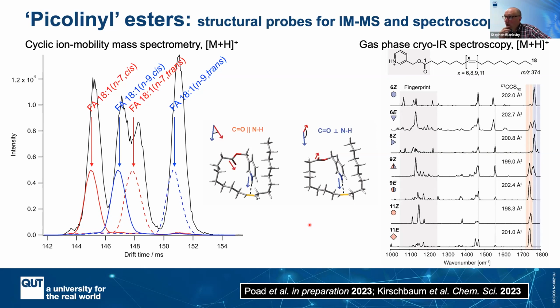And I think the other thing that's been really powerful that Avanti have done is to really look at the SN isomers that are available as well, and really paying attention to the fact that there's a lot of biological variation in that isomeric dimension as well. And so they have a number of new products now that allow us access to those different types of variations. And that's helping us really tackle structural variation. So in answer to your question, Bill, it is possible. I think the key to it is to demonstrate that these molecules are relevant. They're not just a flight of fancy, that actually yours and my metabolism can make all of these things. And so a more standard assay needs to be alert to the fact that these things could be there, and that would require access to some reference material.